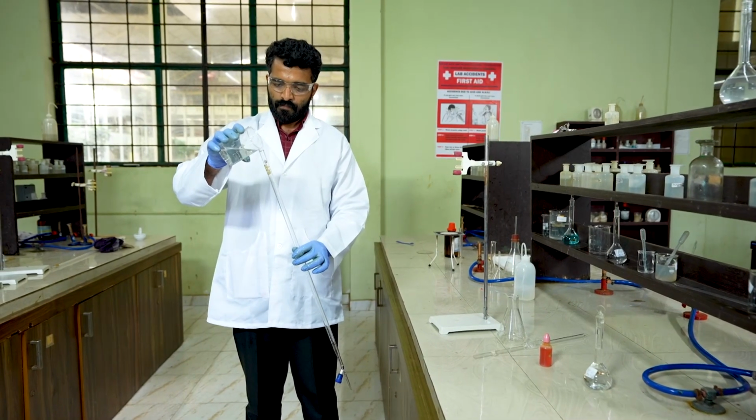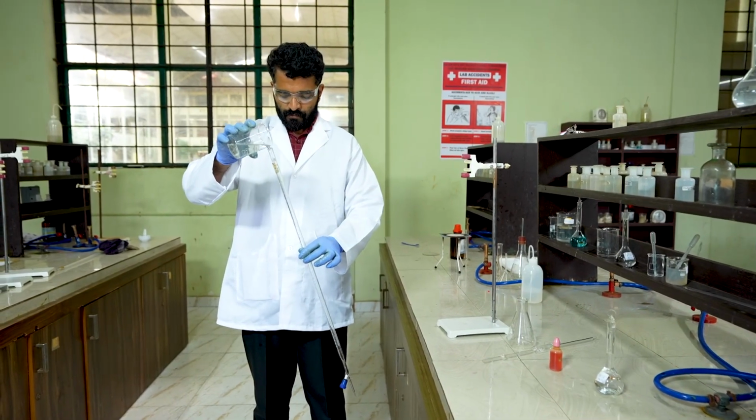So, the first part is the standardization of hydrochloric acid. In the second part, we are estimating the alkali content present in the antacid by titrating with the standardized hydrochloric acid solution. So, we are now entering into the first part of the experiment, that is standardization of hydrochloric acid using a standard solution of sodium carbonate. Over to the experiment.